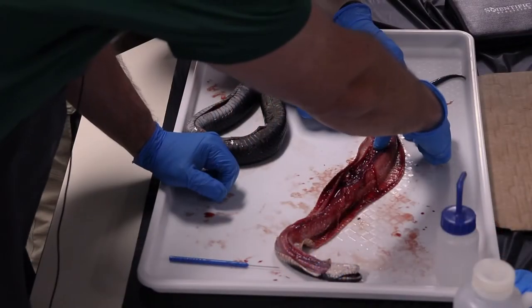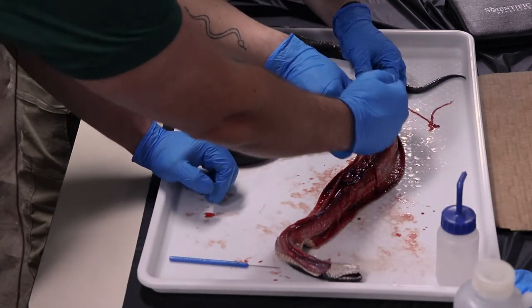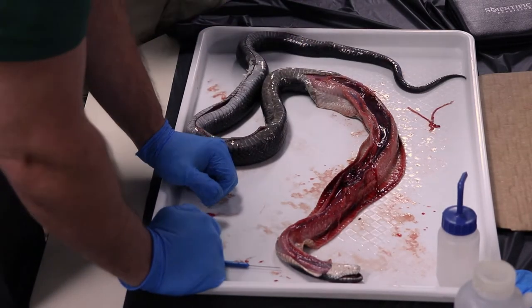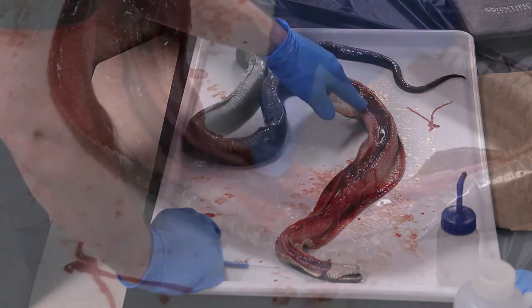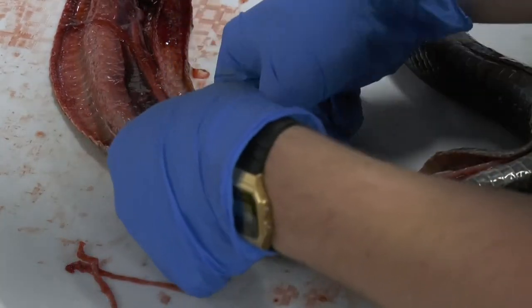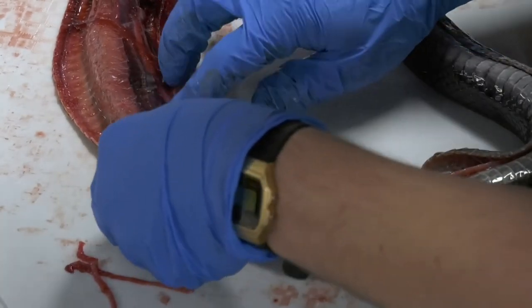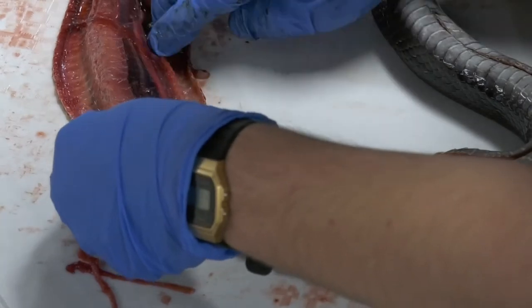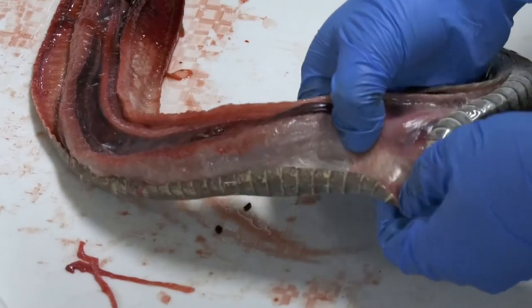Now here's a long tubular organ sitting just medial to the liver, that means beside. Would this be descending from the stomach? Yeah, the stomach should run alongside the liver here. So that could be stomach. It could be the stomach, or intestine. If there was anything in the stomach, we would probably know what it was right away, wouldn't we? Peel some more skin back.